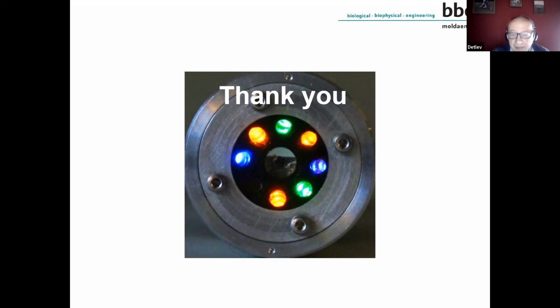And I connected it to rope and let it down to a certain depth and measure then, for example, 2 or 3 times the fluorometric signals. And I get information when this measurement is done, because there is a vibrational signal which I can feel on the rope. And then I know the measurement is performed. I can use another measure and another measure, have to say 3 values. And then I can pull out the fluorometer again and afterwards read the fluorometric results.